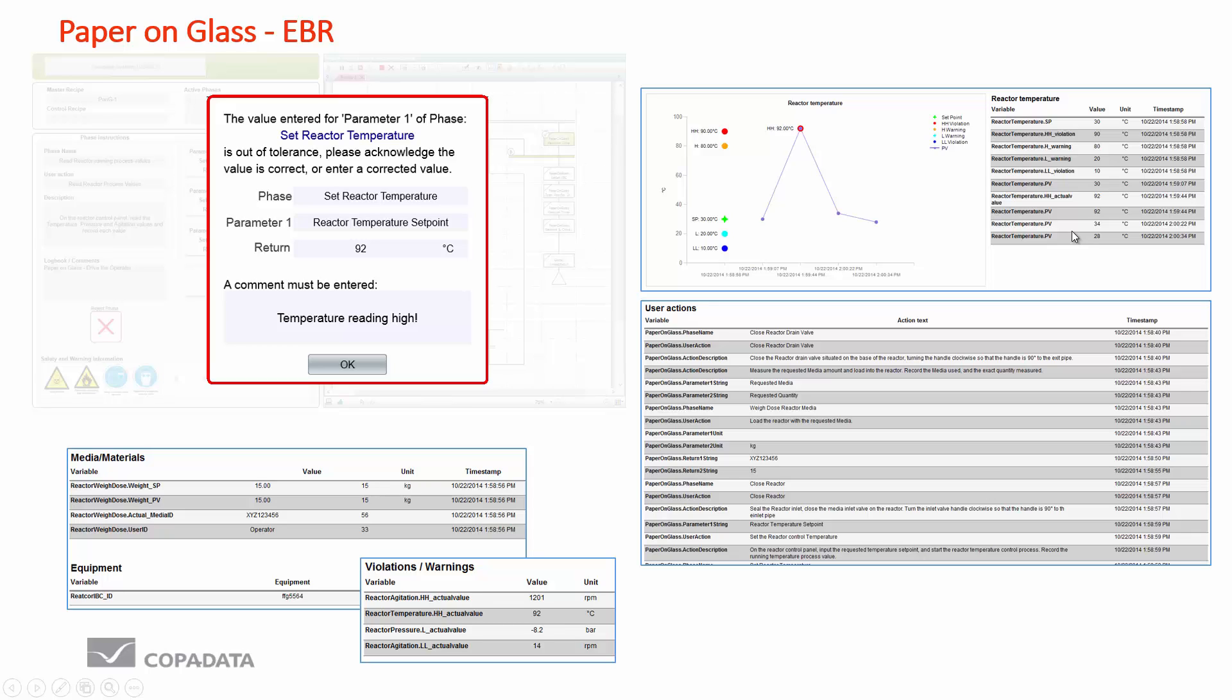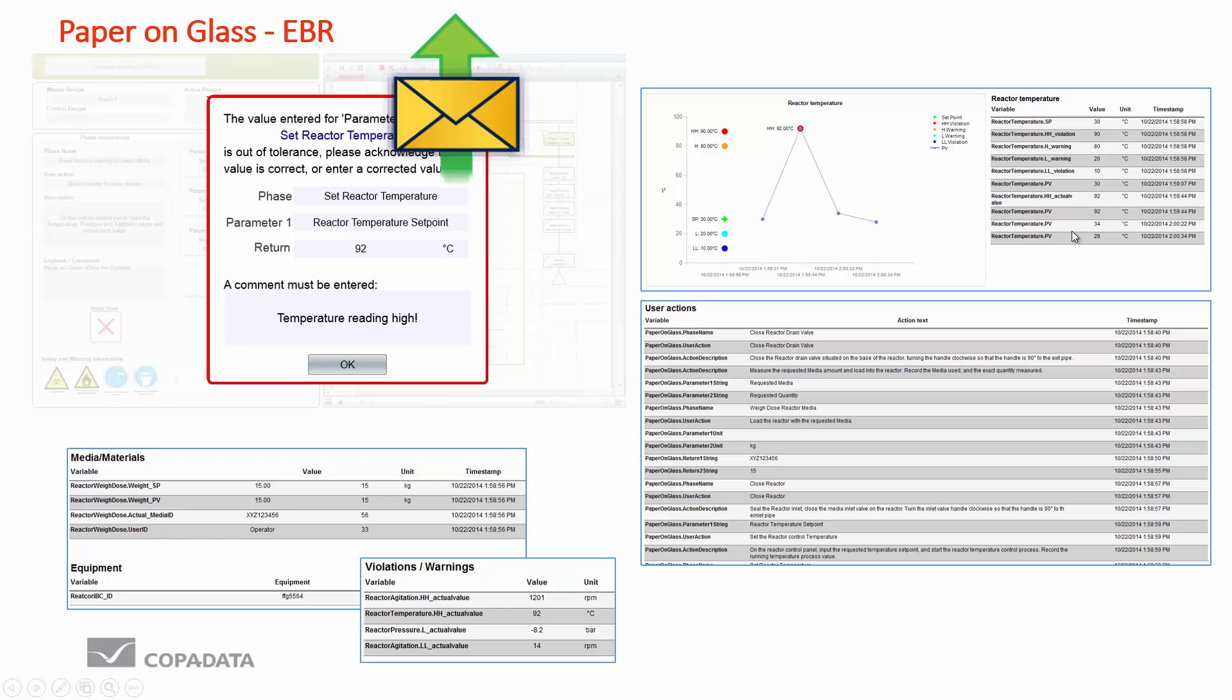In the example system that we have, which I'll show you later on in this presentation, I don't allow the operator to enter values here. We need a quality person to execute this task. So we have this verification of a critical event which is occurring.